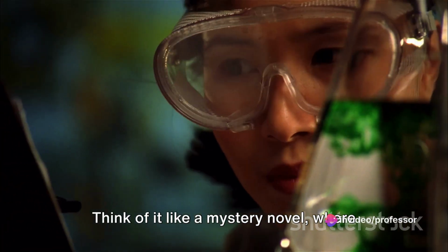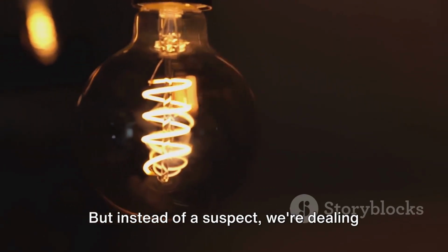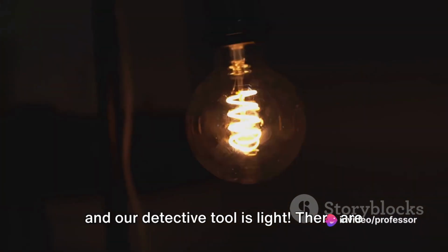Think of it like a mystery novel, where the detective is trying to identify the culprit. But instead of a suspect, we're dealing with chemicals, elements, and compounds. And our detective tool is light.